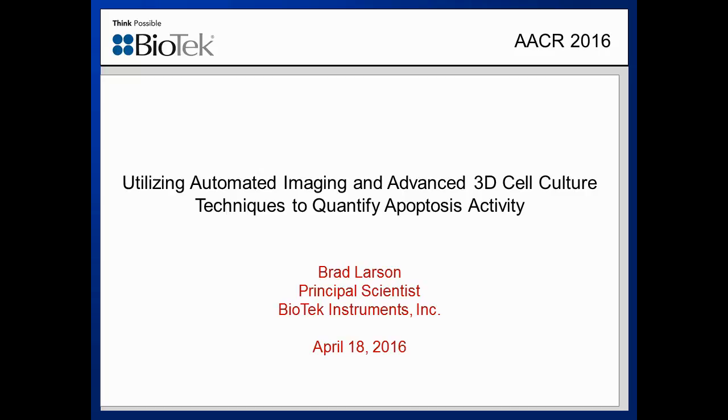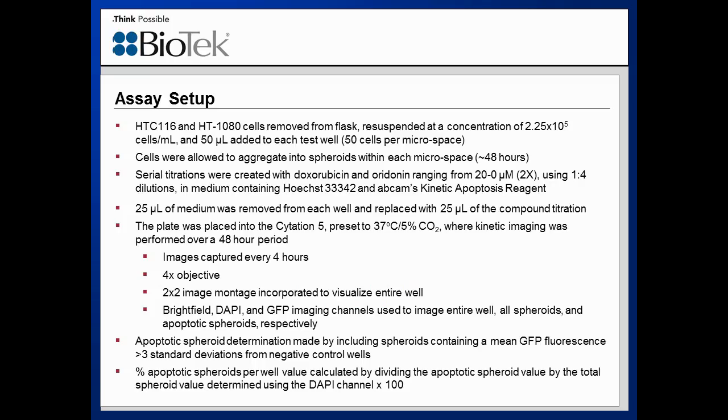I'd like to briefly tell you about a project that we did collaboratively with Kuraray, Elplasia to demonstrate the ability to perform imaging-based apoptotic phenotypic assays using the 384 well Elplasia microspace plates. The goal was to place different cell types within the plates and allow for spheroid formation and then track apoptotic induction over time using live cell imaging.